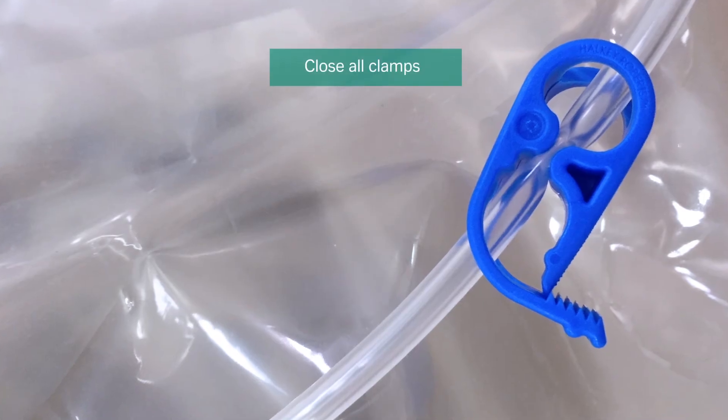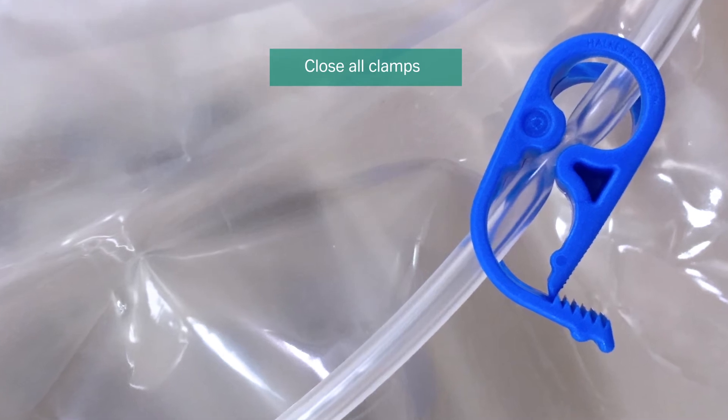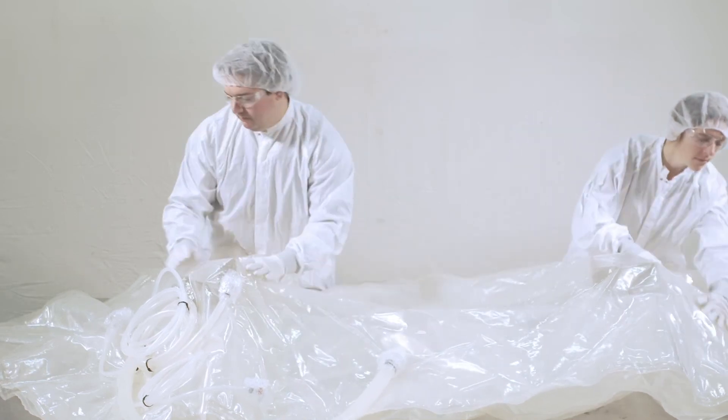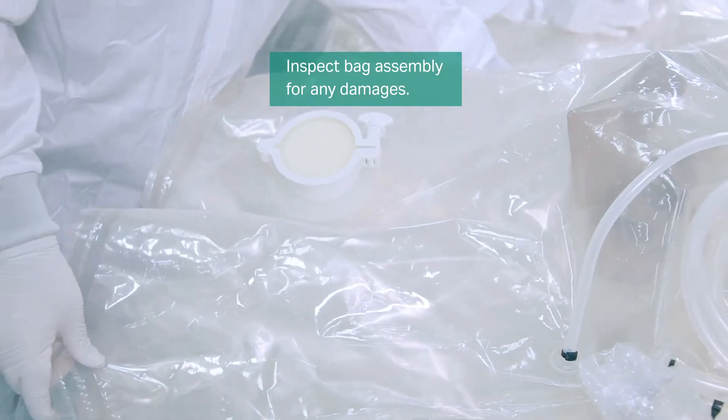Immediately close all clamps after removing the wrap from each component. Place the bag assembly flat on the table and verify that there are no tears, rips or cuts. Light scratches and creases may be present due to handling. These and similar imperfections do not indicate failed bag integrity.